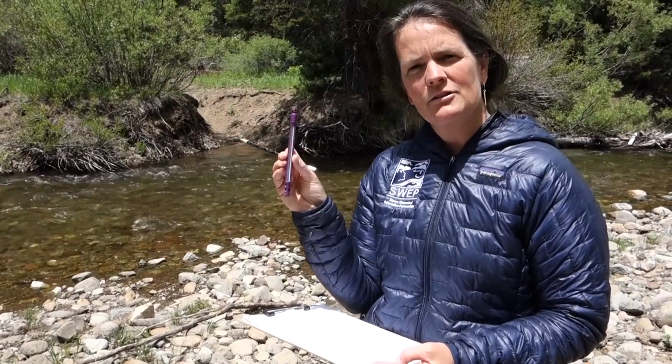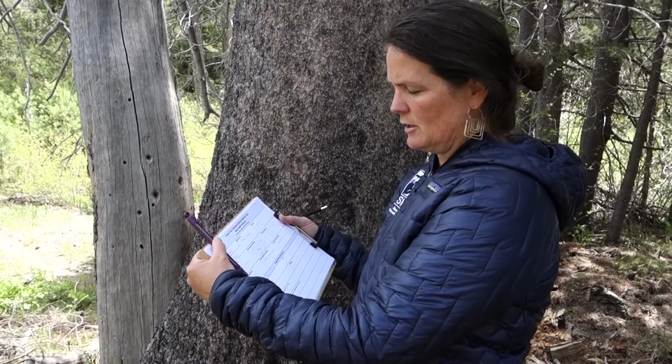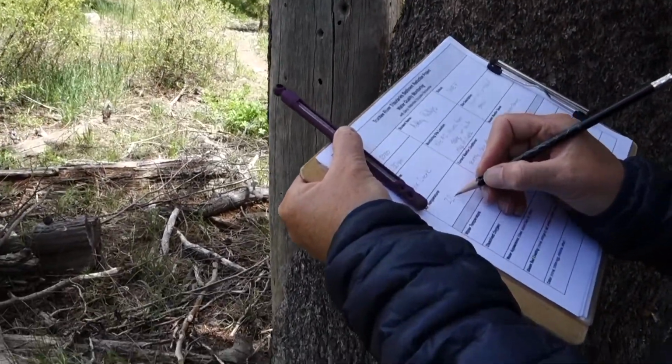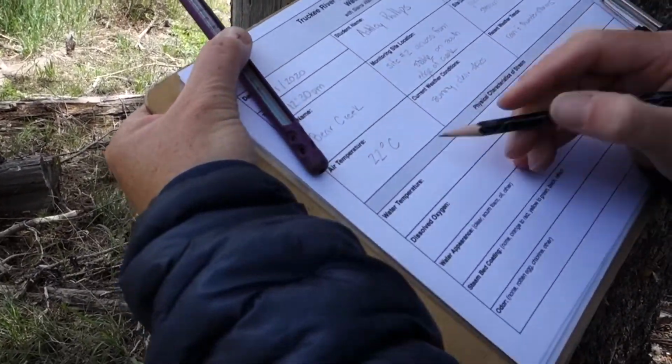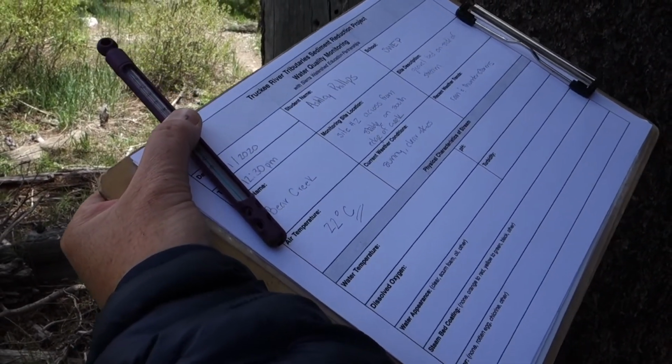You're going to take the air temperature in the shade. So find a tree, leave your thermometer there for a minute or two, and then record your air temperature. So the air temperature in our location is 22 degrees Celsius. I'm going to jot that down right here. Make sure you put the scale in there so I know which temperature you are.